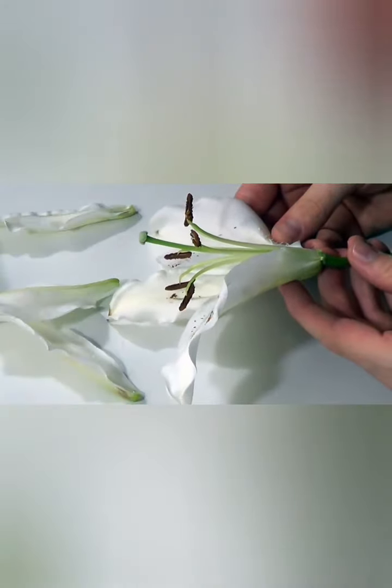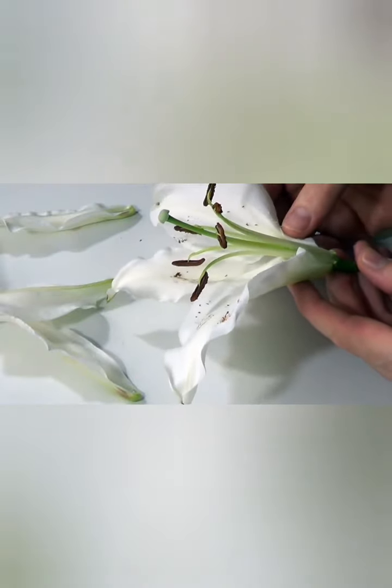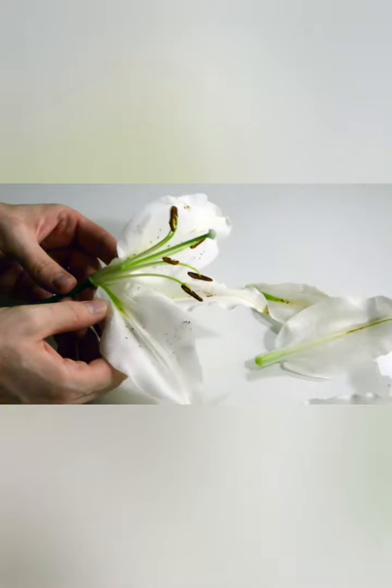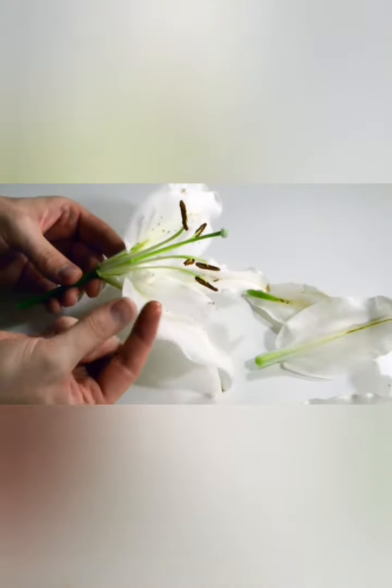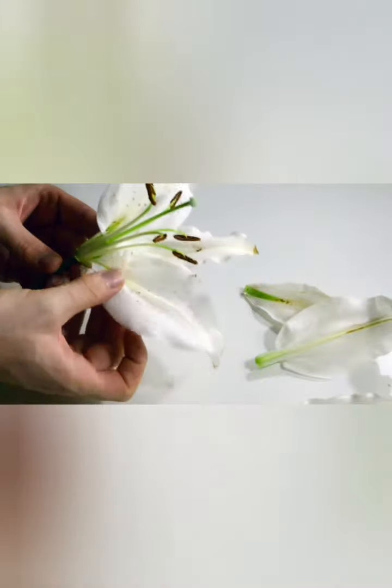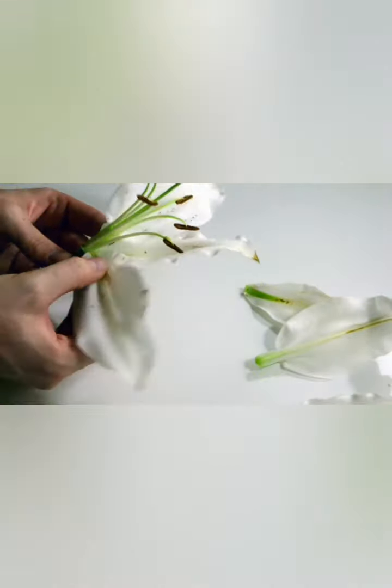Now that we've removed a few sepals and petals, we can see much more clearly what's on the inside of this flower, and you can see on this one that we've got both the male and the female reproductive parts which have been produced at once. At the base of the petals here we've got this sticky sugar containing fluid, and this is known as nectar, and it's there to attract insects which are necessary for pollination.